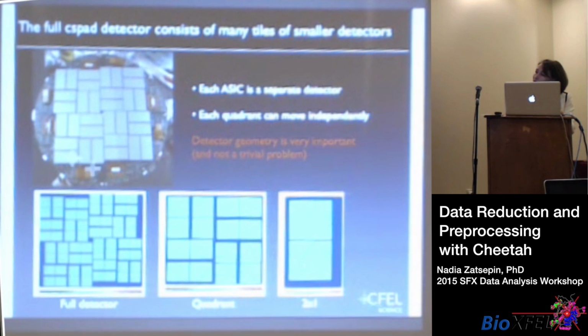Now I'd like to talk briefly about the detector. It is, like I said, specifically designed and built for the LCLS. And it is modular, and part of the reason is the high readout rate. So it's a pixel array detector with 64 components, 2 of them stuck together, so they move as a rigid body.